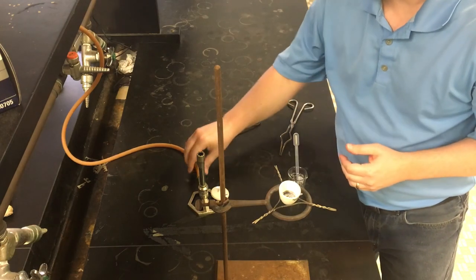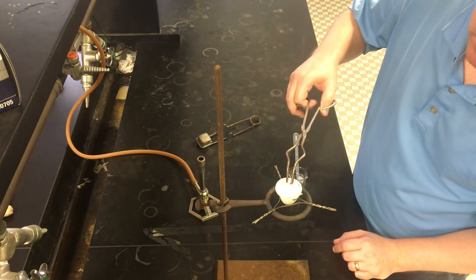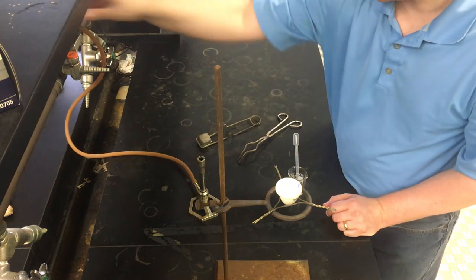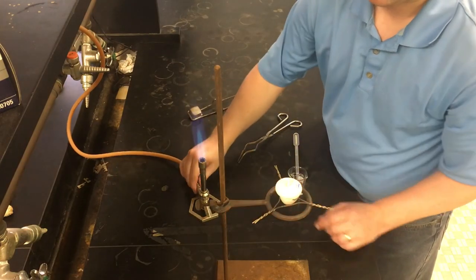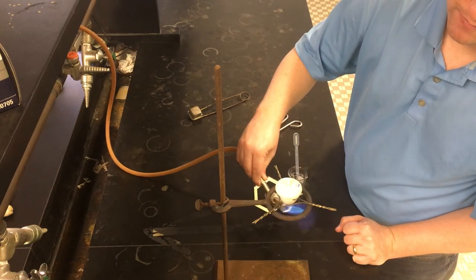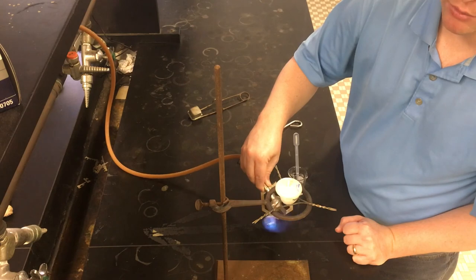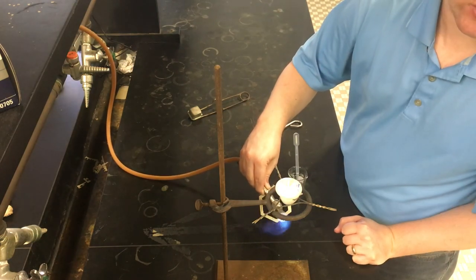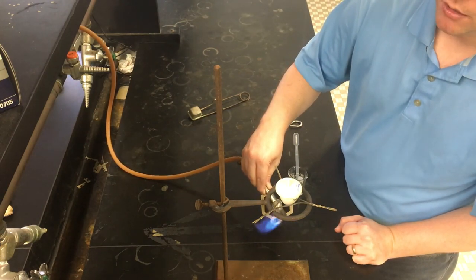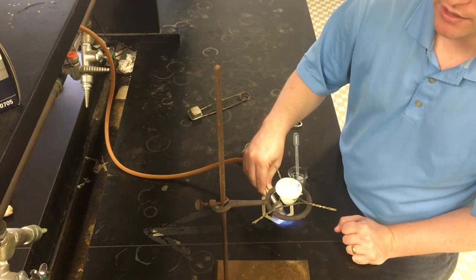Now I'll do the same heating step as before. I'll turn the Bunsen burner back on one last time, put the crucible lid back on — we don't really need air access anymore, we just want to drive out the water — then waft the flame under the crucible to avoid unnecessary thermal stress. I'll heat this for about two minutes, then let it cool to room temperature before taking a final mass. I'll cut the video here and pick it back up when I get the final mass once things have cooled down.